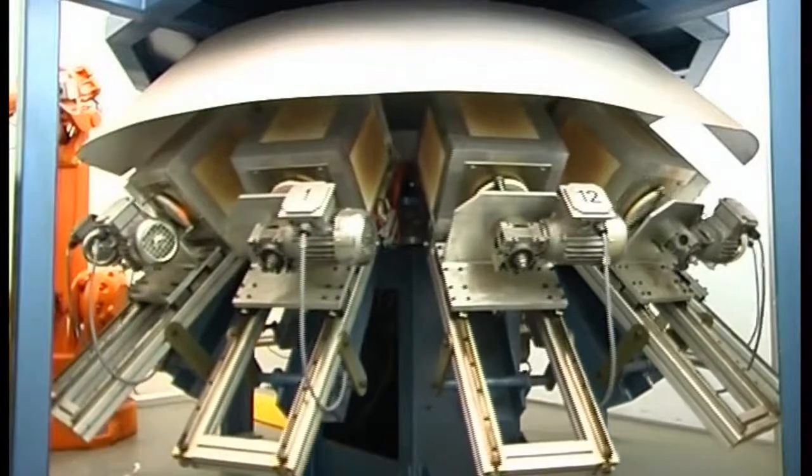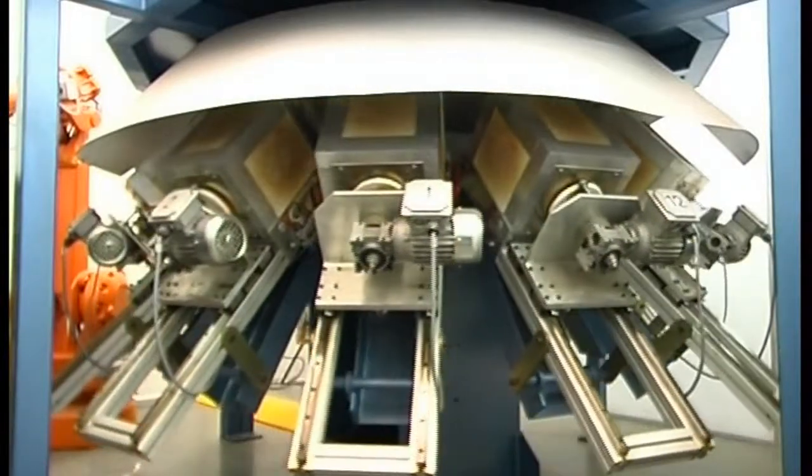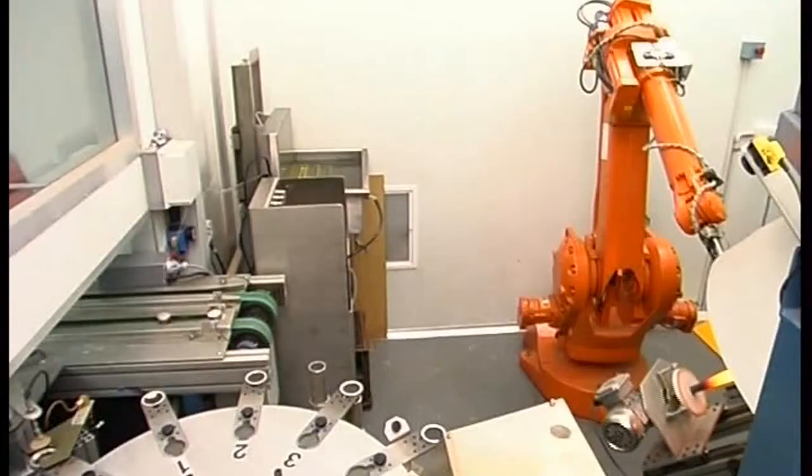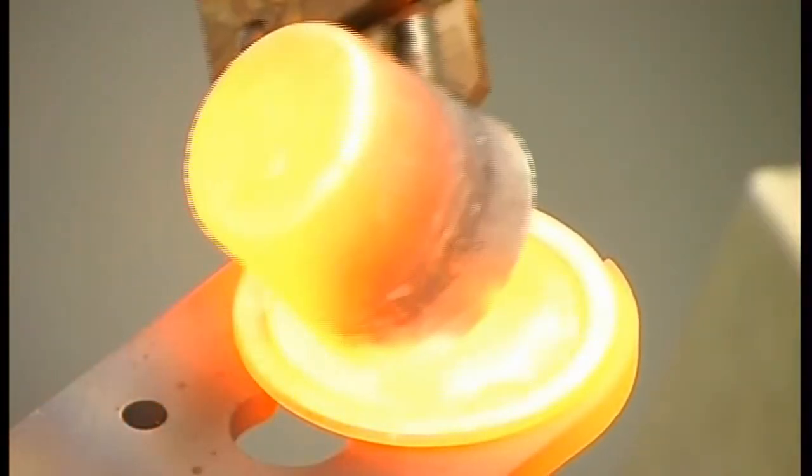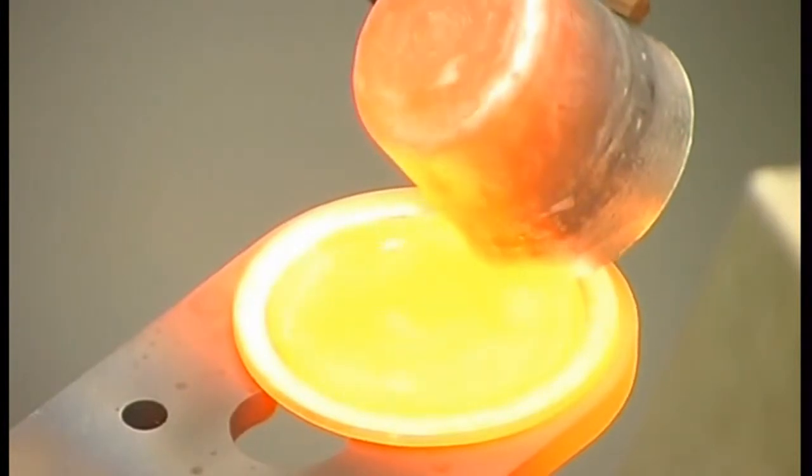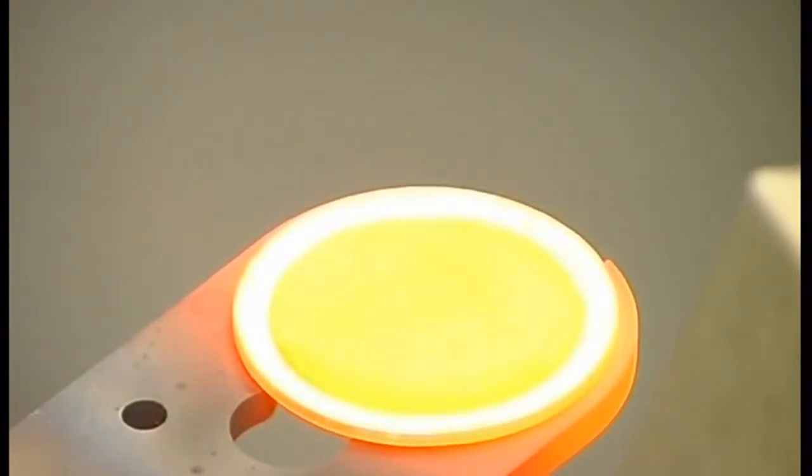Fusion is completed during one full rotation of the furnace carousel. The robot pours the molten contents of the crucibles into preheated platinum moulds supported on a mould carousel.